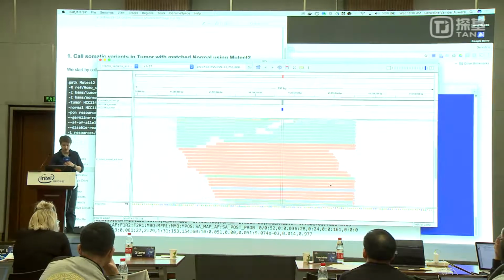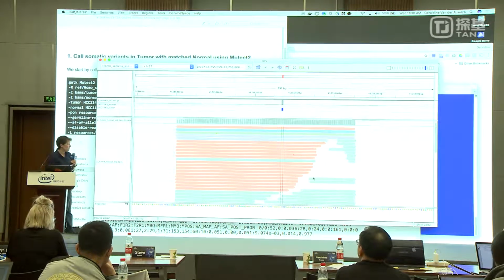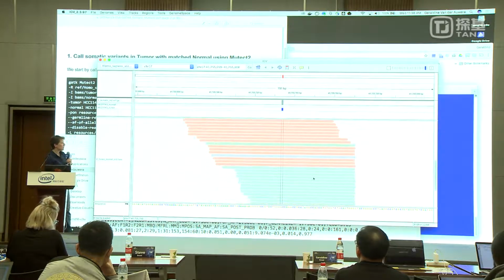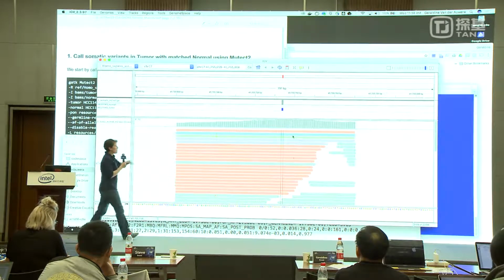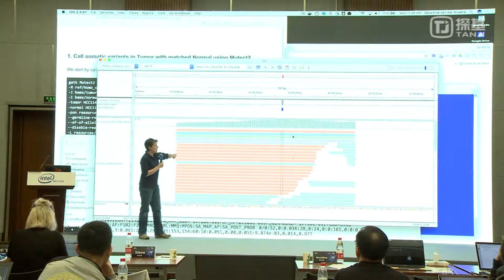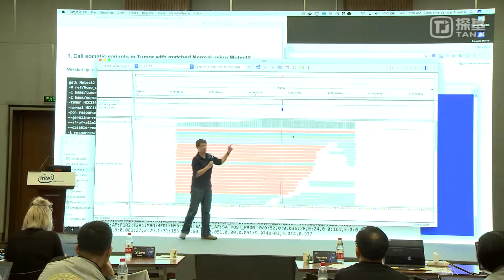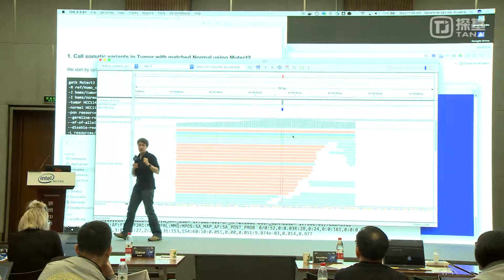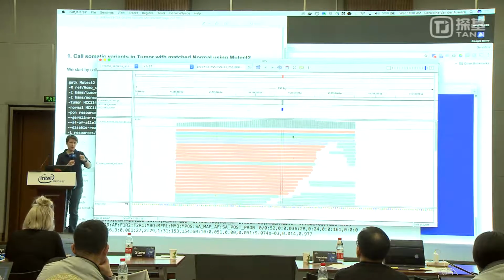And so here you have a number of reads, and I should add also the way the reads are colored. You see that these top four of the four different colors, those are, like I mentioned, the artificial haplotypes. The other reads on my screen are colored according to which haplotype they support. Now, you might not be seeing that yet, because we haven't set that up yet for you.